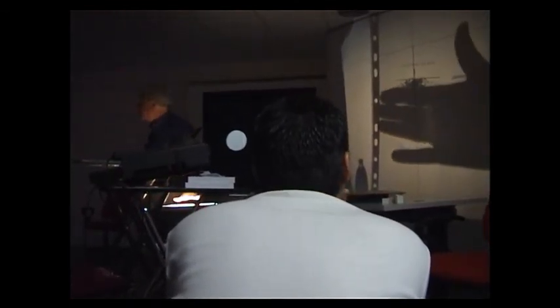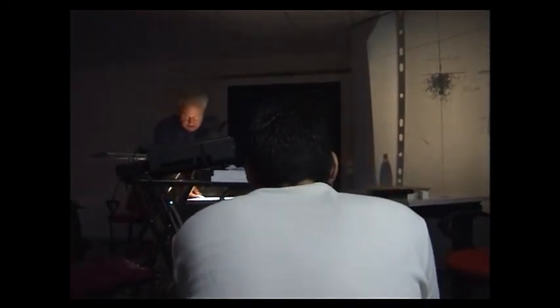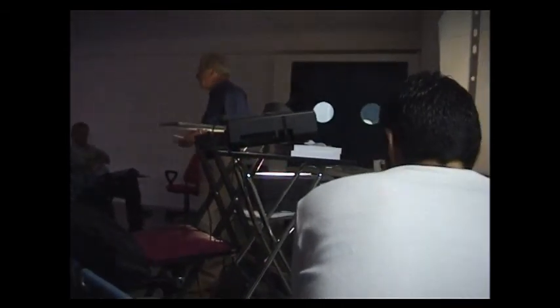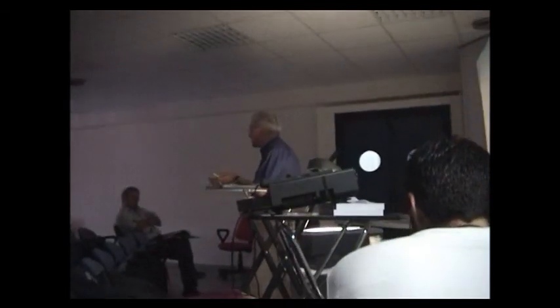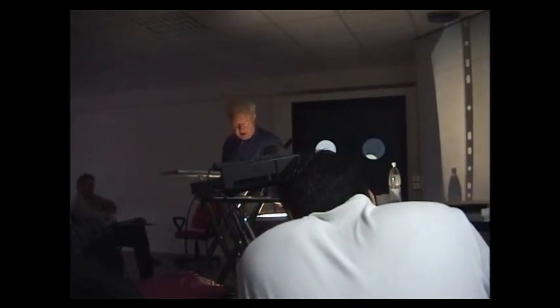You see that it is not possible to do the same thing with a beam of electrons, due to the interaction of electrons with material, because of the scattering in every direction. And it is possible to do with protons. The material is then not heated, because when you send particles on material, you heat the material if the material is kept in the vacuum. It is not heated in air because the air can remove the heat deposit.